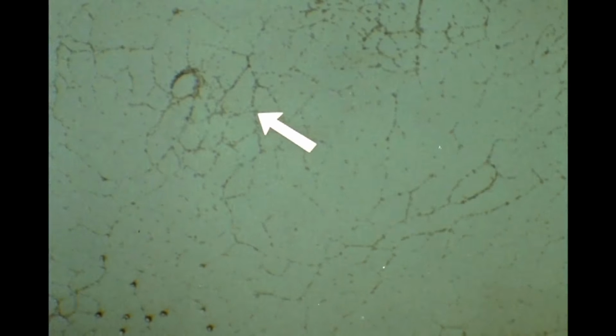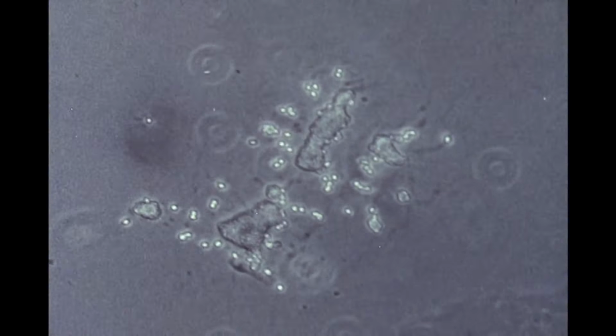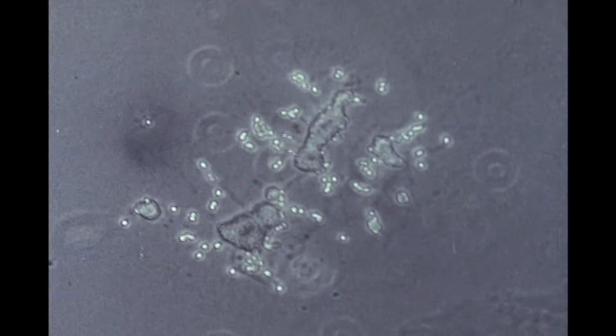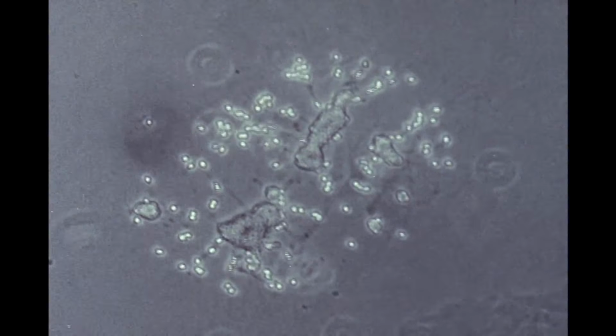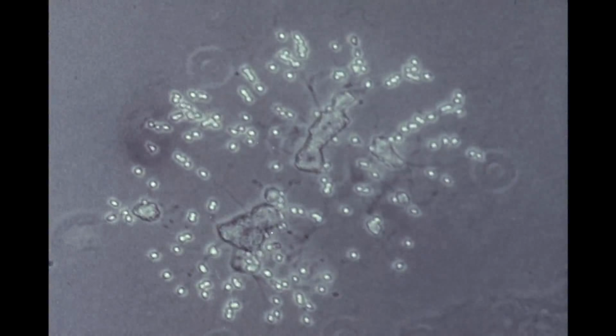In the older parts of the colony, cells are aggregating prior to the formation of resting structures or cysts. When the cysts are placed onto fresh nutrient medium, the cells become active once again.